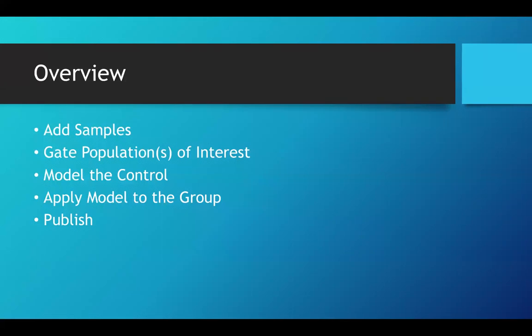The same thing goes for other types of tissue. I wouldn't recommend this model for adherent tissues unless you've got adherent cells that have been adapted to growing in culture. And again, that has to do with the size of the cell. If the size of the cell is fairly uniform, it helps to detect those division peaks really easily.